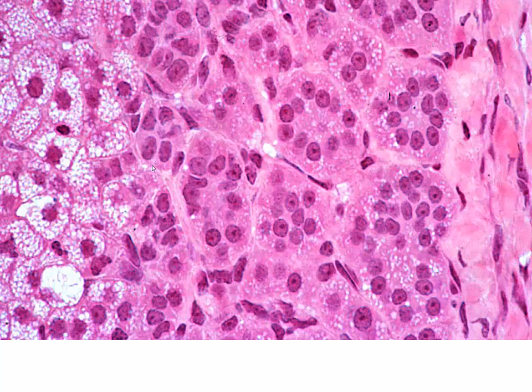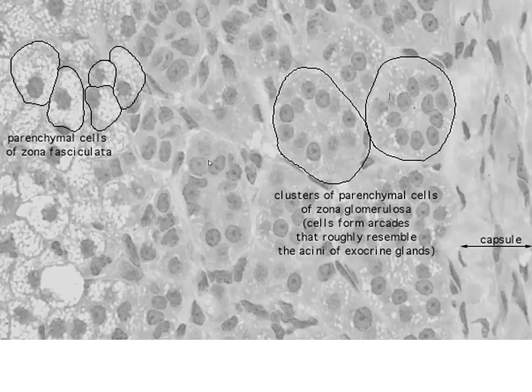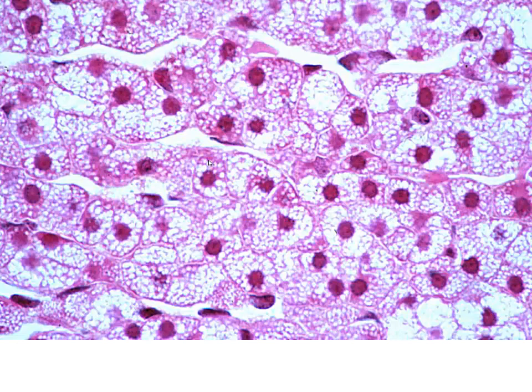So for instance, here's a higher mag, and you may not at first be comfortable going, yeah, it's an acinus of something, but I'm not sure. Well, here this almost looks like connective tissue, but then you see these spongiocytes, and that's going to be your clue, the associative nature of one to the other. That is so characteristic of what we see in the adrenal cortex that you will know based on that arrangement that we're looking at the zona glomerulosa followed by the fasciculata. That makes it much easier. So keep those associations in mind, and don't just focus on the characteristics of a particular region, but also know what are the adjacent regions and how would that help me determine where I am.